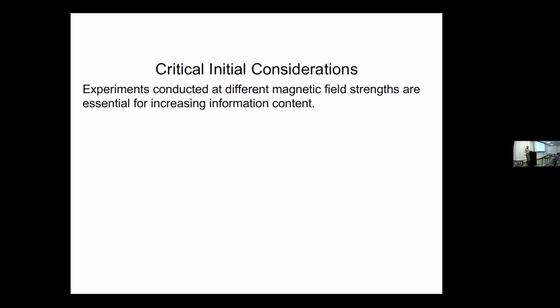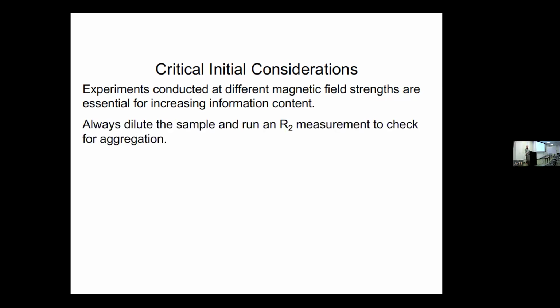And there are not lots of places where you can acquire 3 to 5 different static magnetic fields, at least for highly quantitative measurements.